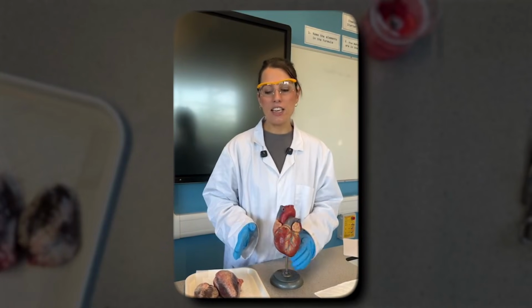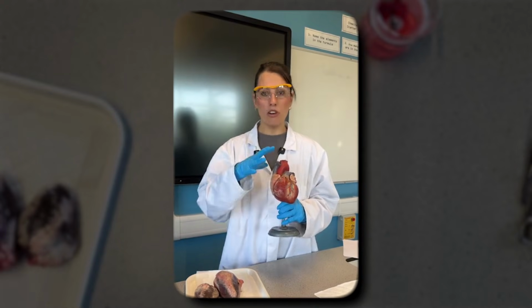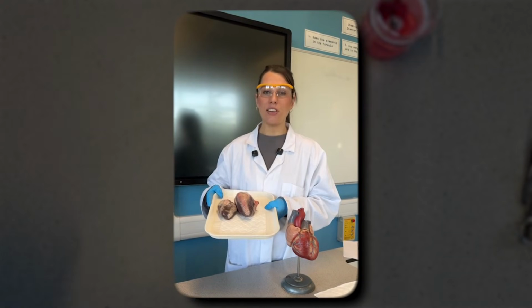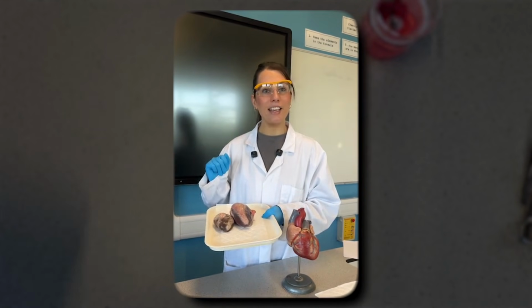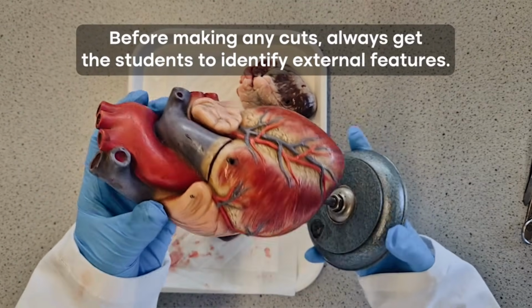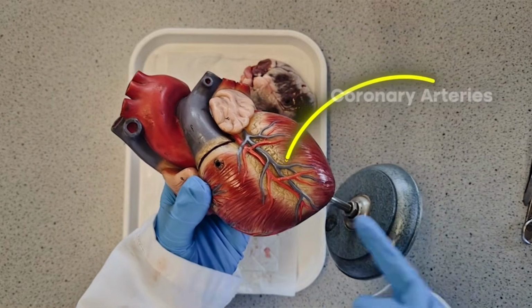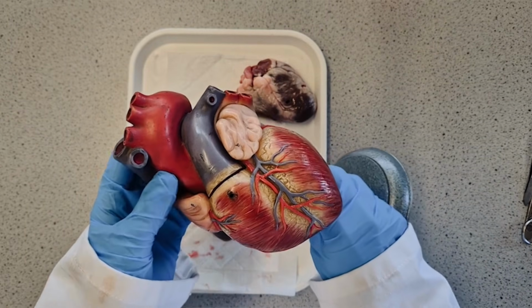Before any heart dissection, I always show the students the key structures that they need to know on the heart, on a model, and then actually on the outside of the heart as well. So let's take a look. So here we have the model of the heart, and the key things that I like to be able to identify on the heart with the students are coronary arteries that run on the outside of the heart.